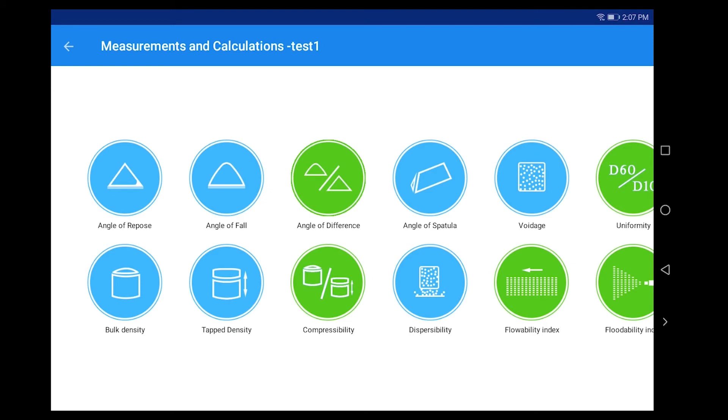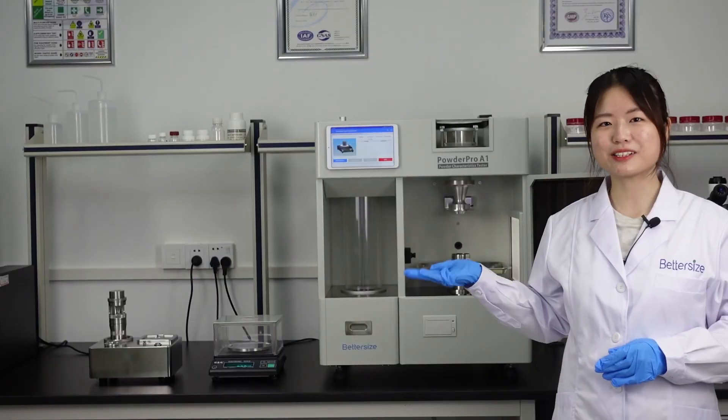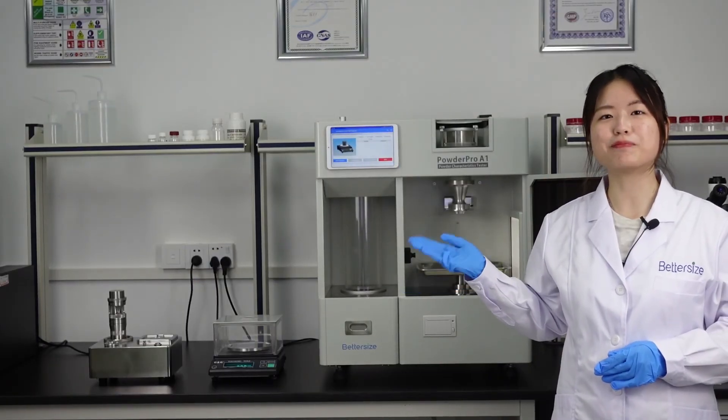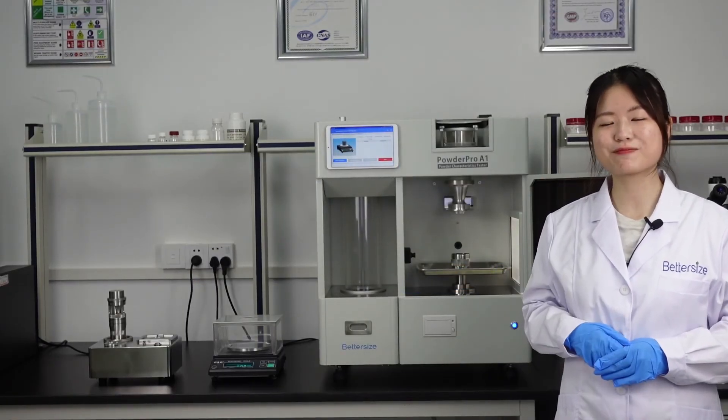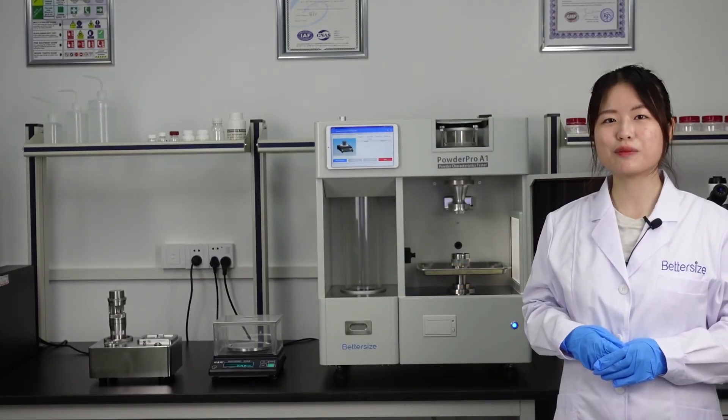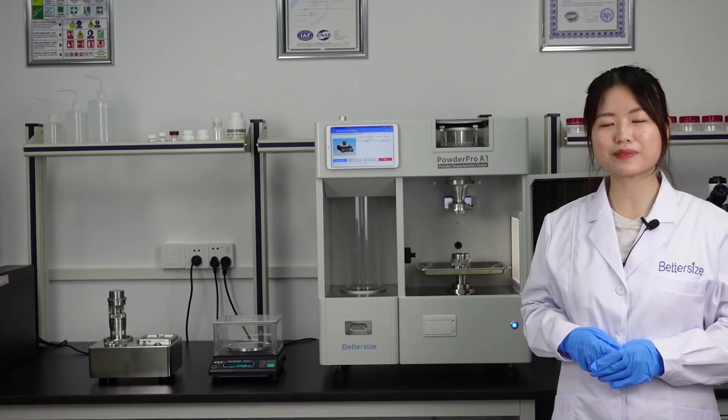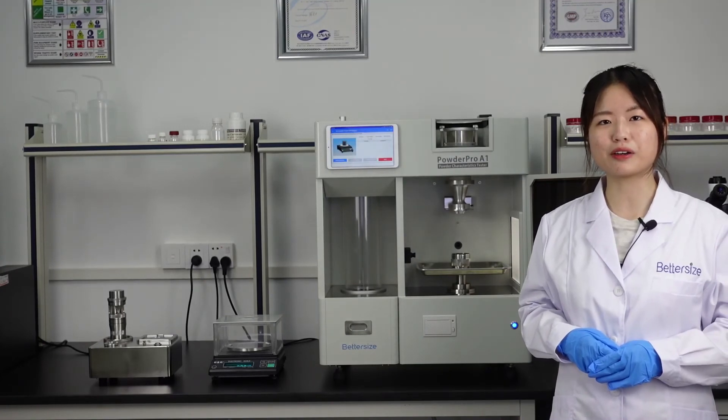It is recommended to repeat the test three times to calculate the average value. This is the measurement of bulk density. Next time we will study the tap density of the powders.